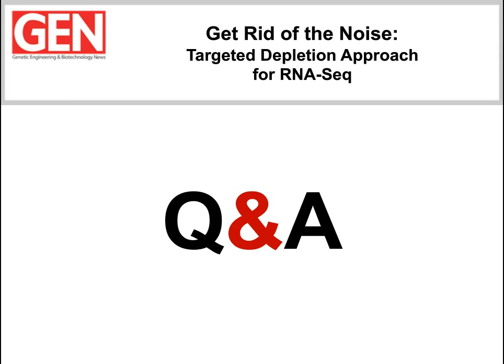Okay, thank you very much. Maureen, another question for you. How can an individual tell whether genomic DNA has efficiently been removed from a Solo library?